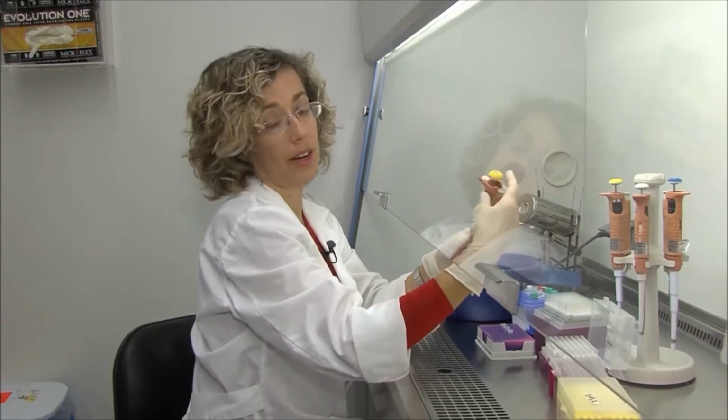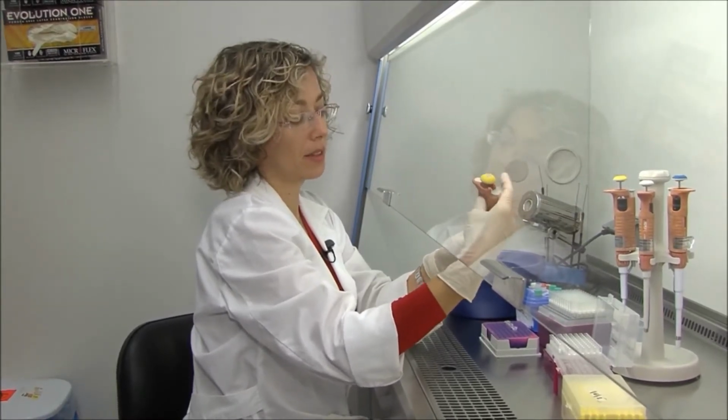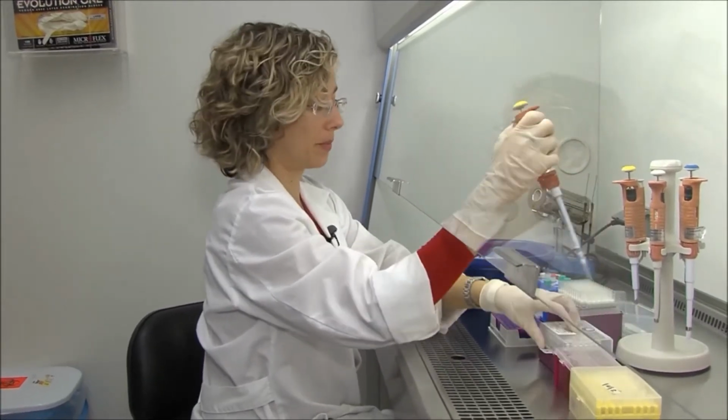And then we are gonna add the primers, the dNTPs, and finally the Taq polymerase.